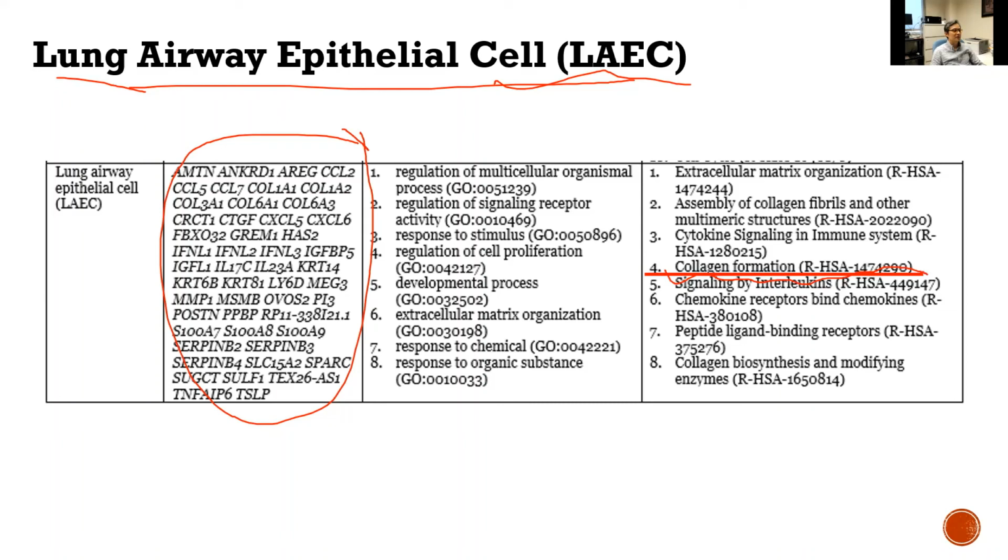So again, this tells you the function associated with this particular cell type. Cytokine is also enriched, so these cell lines also have some immune system related functions. So there is some overlap with the lymphoblastoid cell line, but overall, the highly variable genes also reflect the function of the cell type from which they are identified.